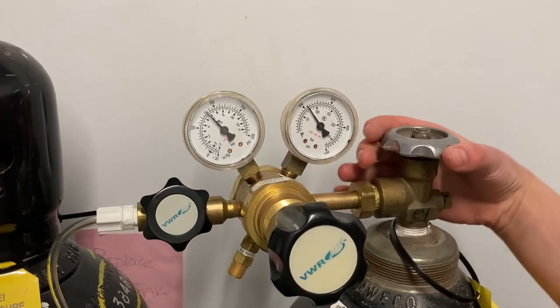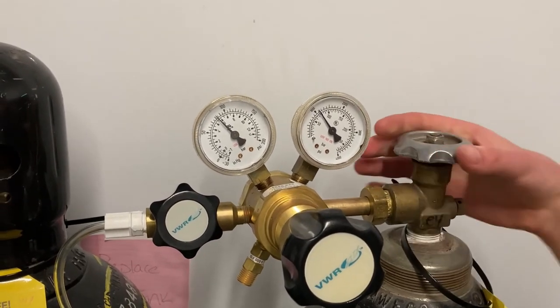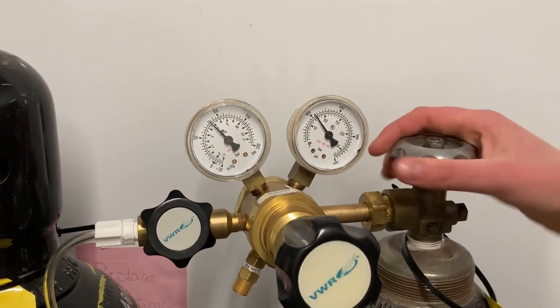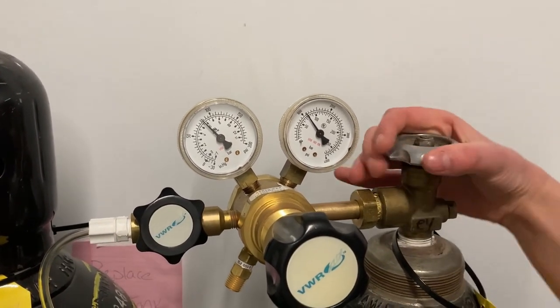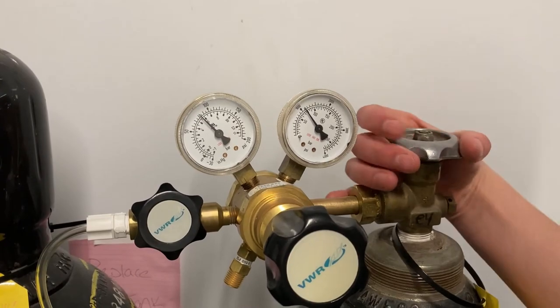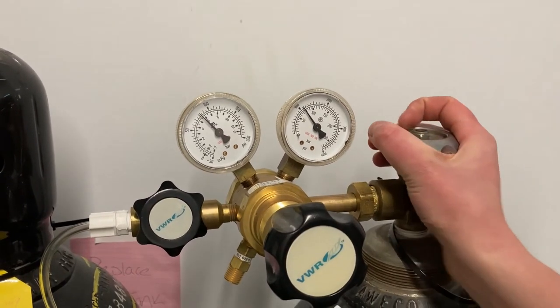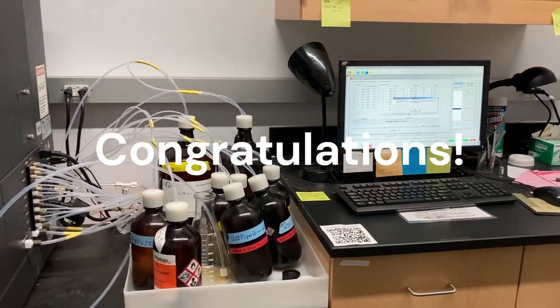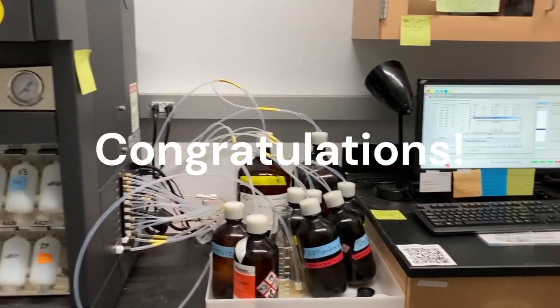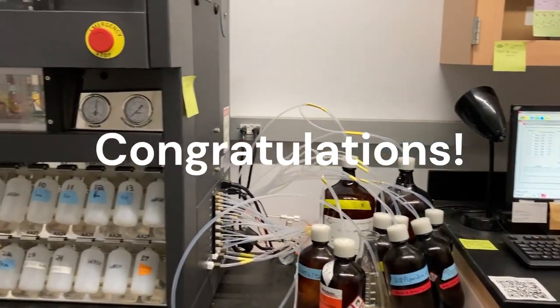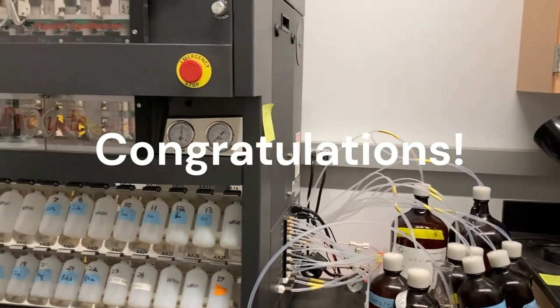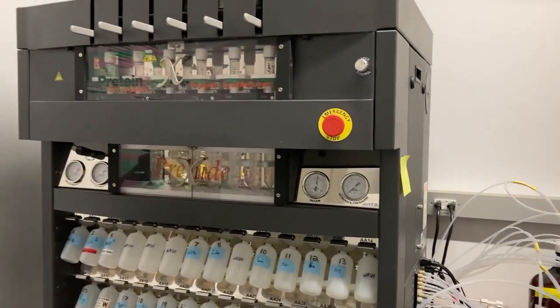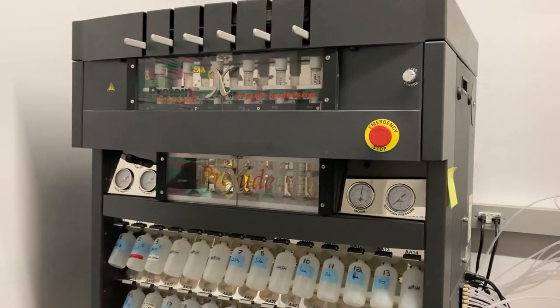Lastly, turn off the nitrogen tank's main valve. Congratulations on successfully completing a synthesis on the Prelude X synthesizer.